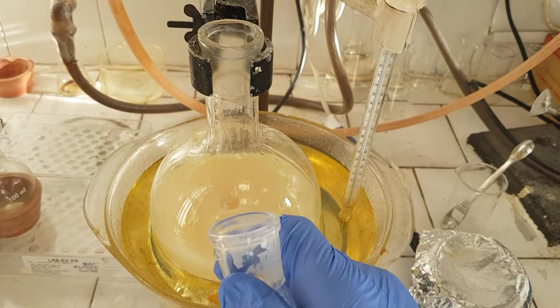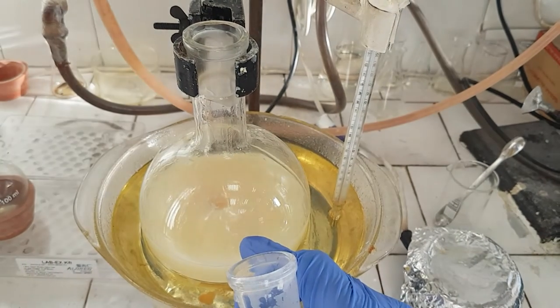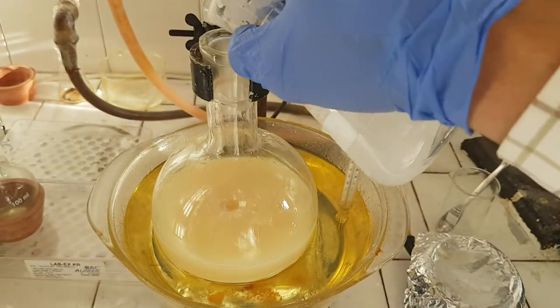And some bubbles. Because the reaction of acid plus base will produce water plus carbon dioxide — this is the carbon dioxide gas.